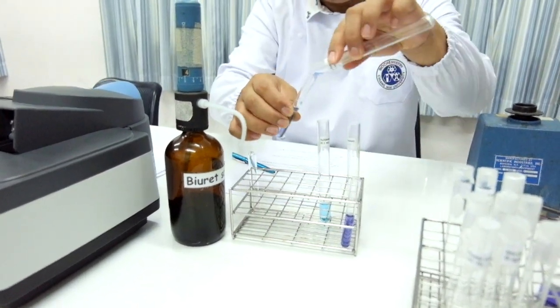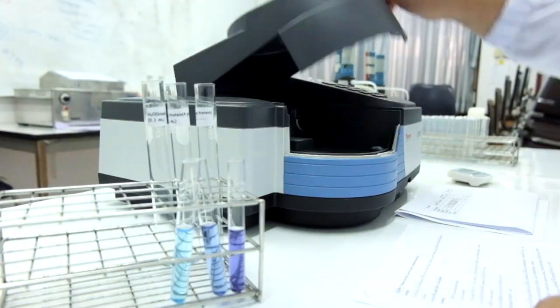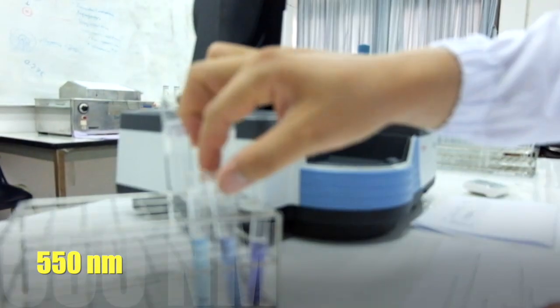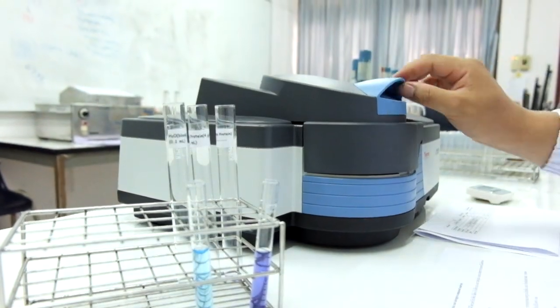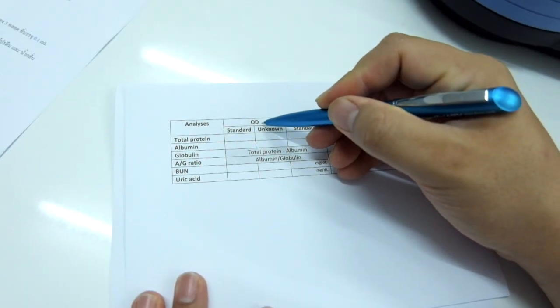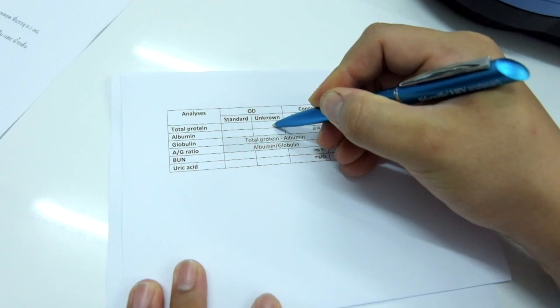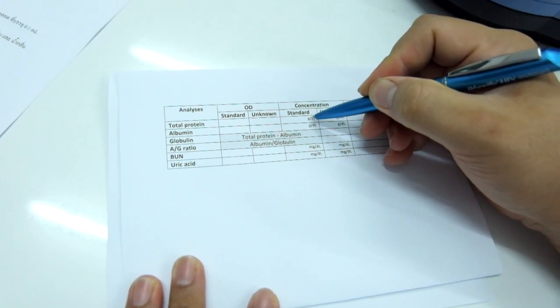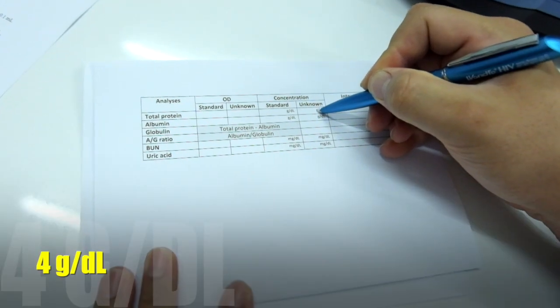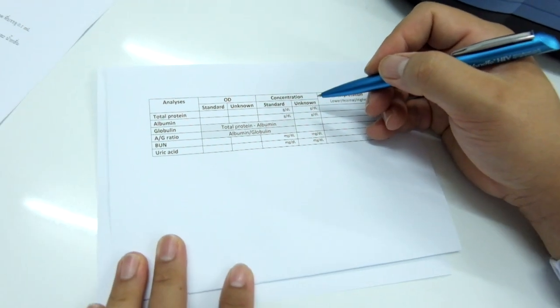Determine the absorbance in the unknown serum and the standard protein at the wavelength of 550 nanometers and set 0 with the water tube. Record the absorbance and calculate for the protein concentration from the standard absorbance value with 4 gram per deciliter in the concentration. Take a note of the result finally.